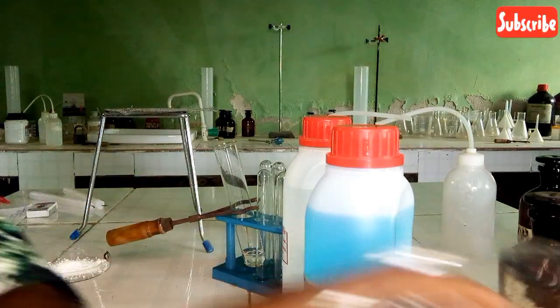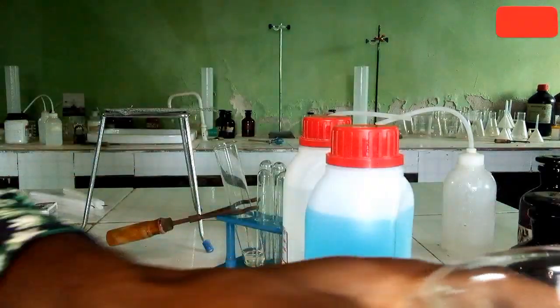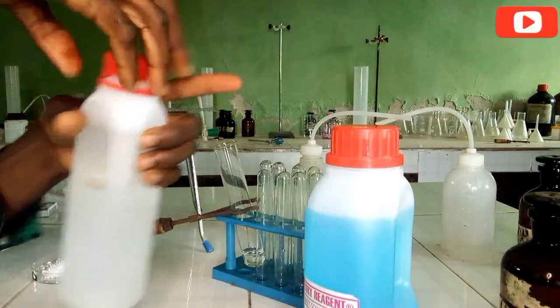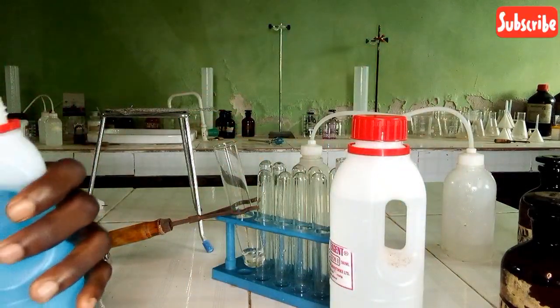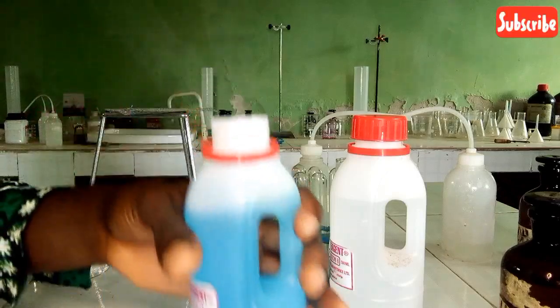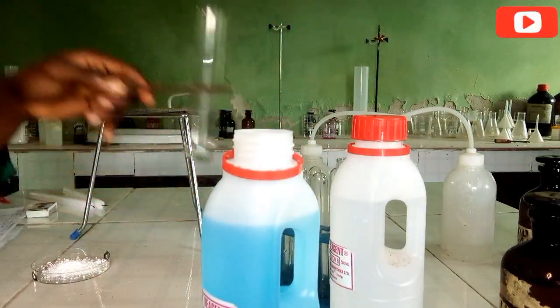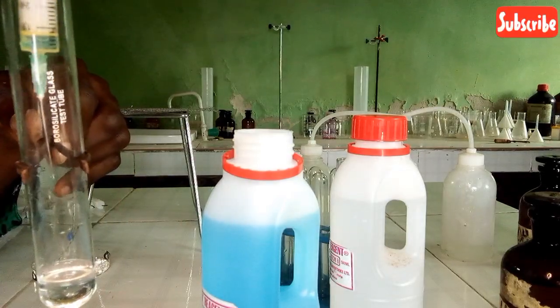So how do we achieve that? I will measure a small part of Fehling A first. Okay, Fehling A first. So this is Fehling A. Let's add a little bit into the solution.